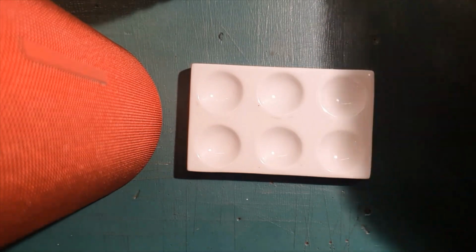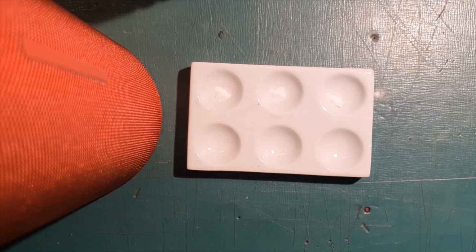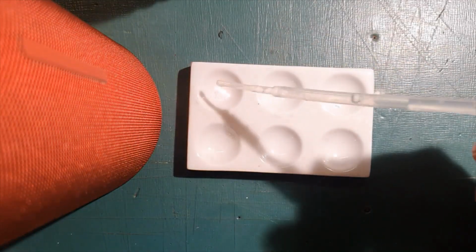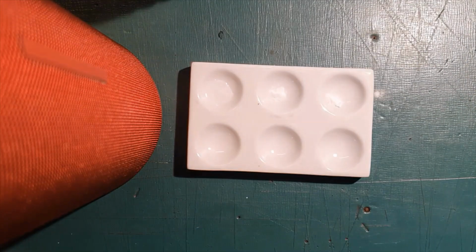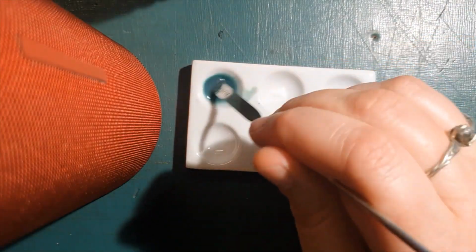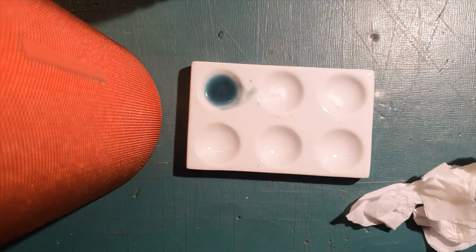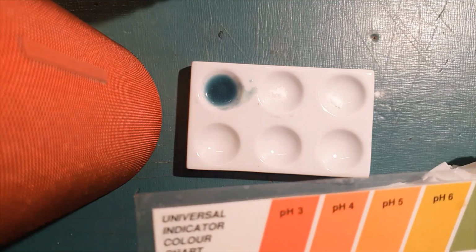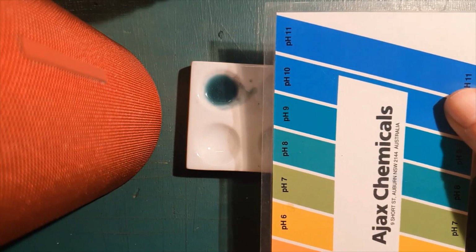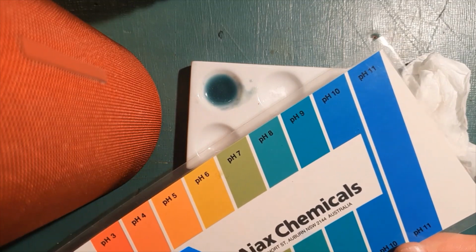And now we're back to test it. Okay, so we're going to do baking soda. And here is some I've prepared earlier. Okay, so the first one, we're going to add some water to dissolve it. And universal indicator, let's test the pH. Okay. So that's a pretty color that we haven't had before. Which pH do you think that's at? Make your own decision.